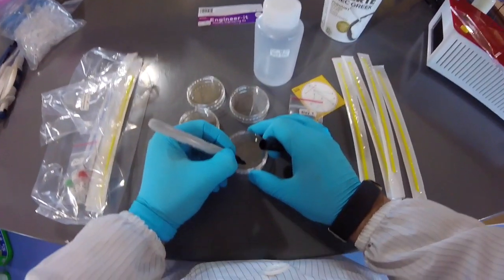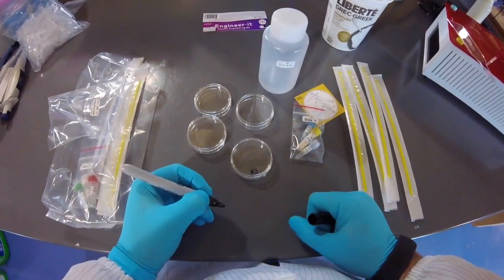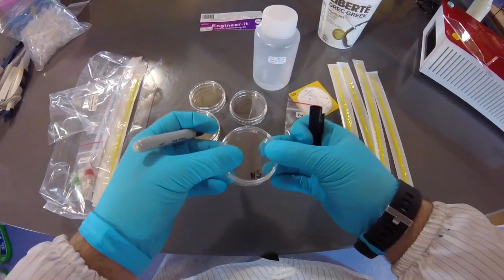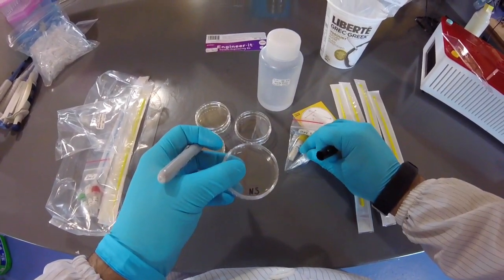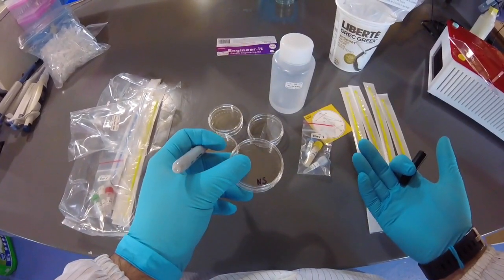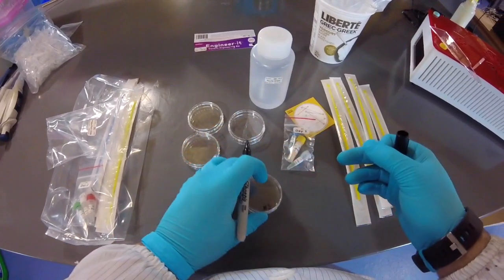So for the engineering kit experience, we have a few different plates here. We're going to have one plate where I'm going to write NS, which stands for non-selective. This means that there's going to be agar in here, but it's not going to have any antibiotic, okay? And this is because we need to grow our blank cells, which aren't engineered yet and don't have any sort of antibiotic resistance. All right, so this plate we're going to be using to streak cells today.